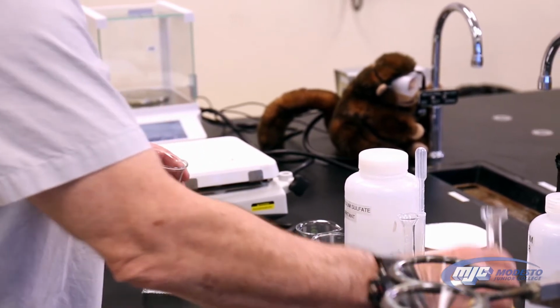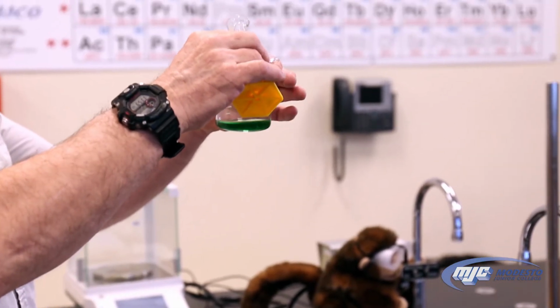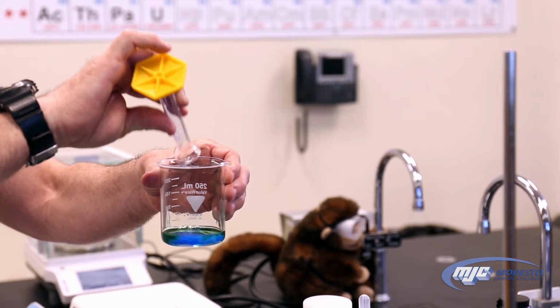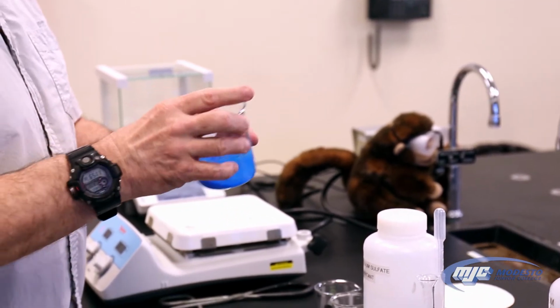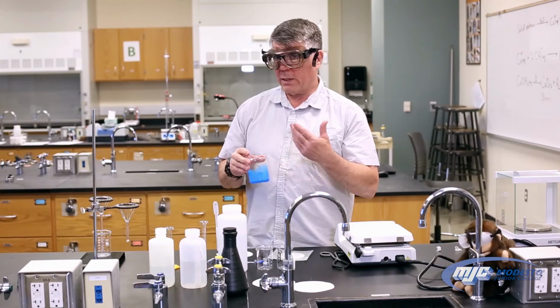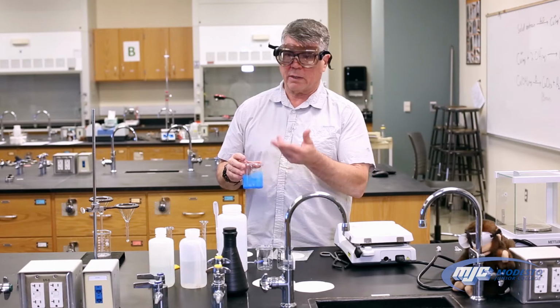All right. And now I have 10 milliliters of 6 molar sodium hydroxide. So watch what happens when I add this. It's kind of cool. See that blue there? That's slushy. That's our copper 2 hydroxide that's forming. So now what we want to do is heat this up, add the heat so that it decomposes into the copper 2 oxide and the water.